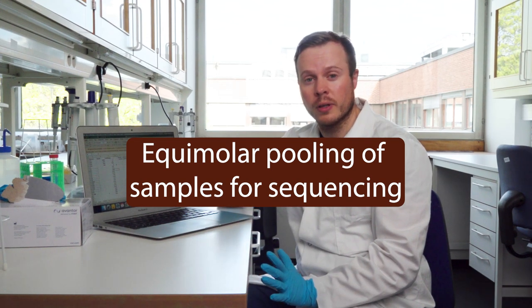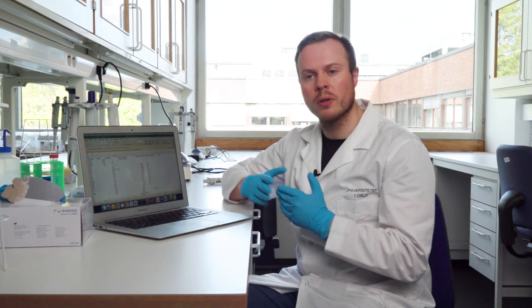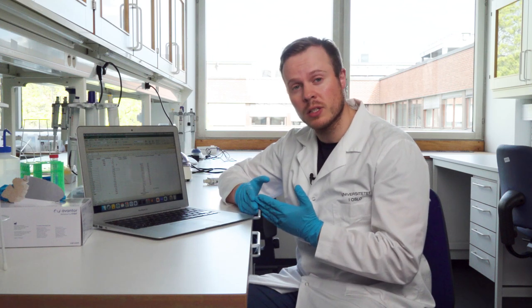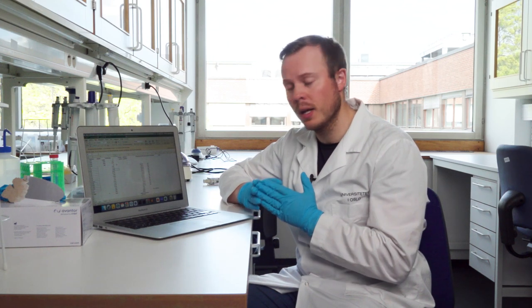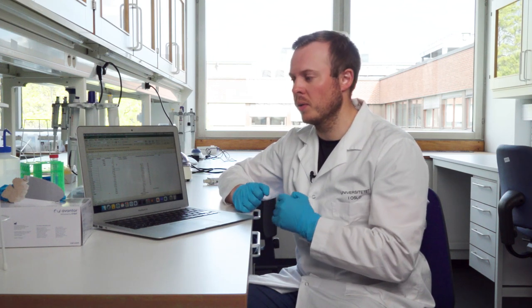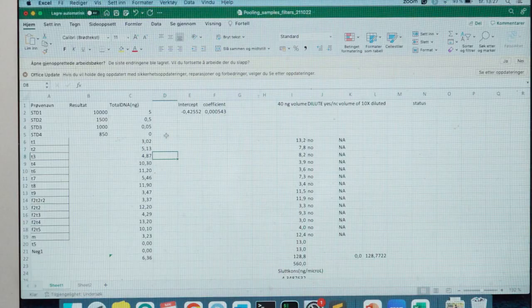So now we have run the PicoGreen, gotten the results, imported them into an Excel sheet, and here we kind of get the values we need for the pooling.